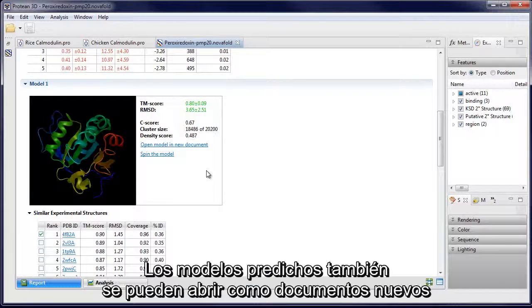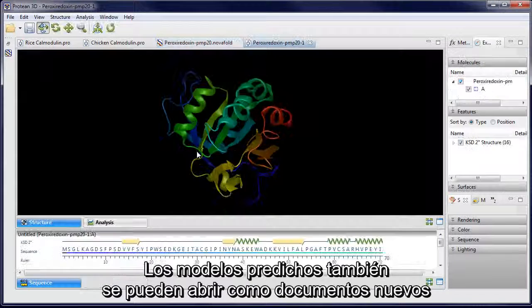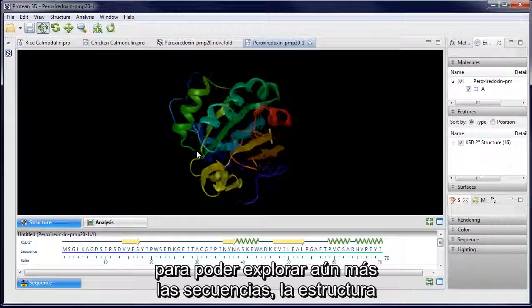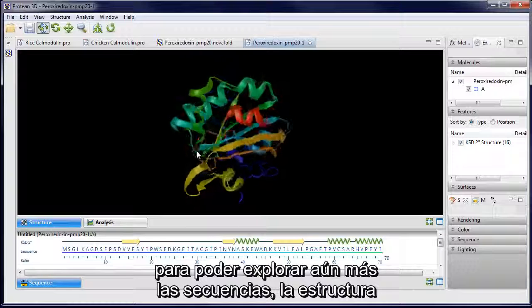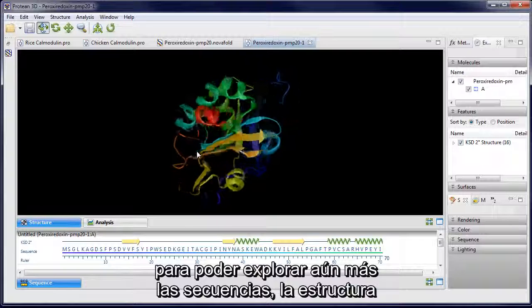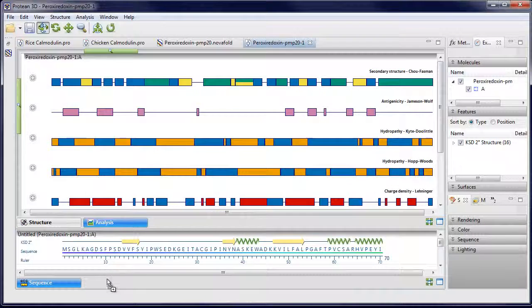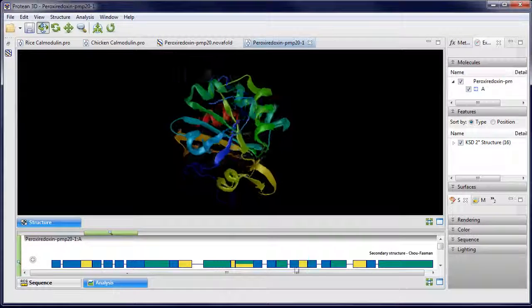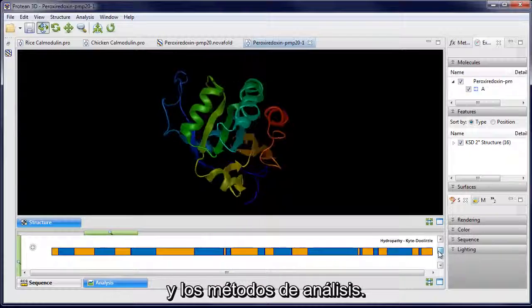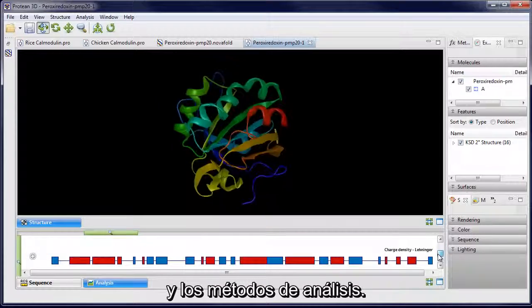Predicted models can also be opened as new documents, allowing you to further explore sequence, structure, and analysis methods.